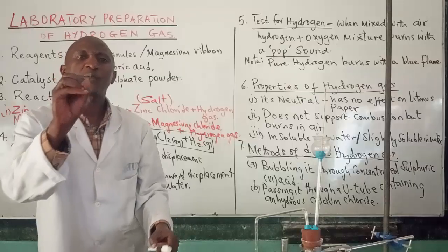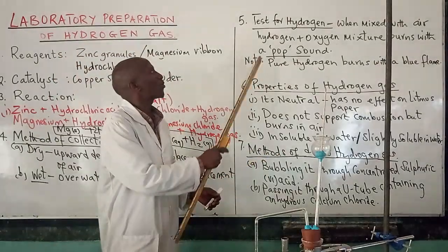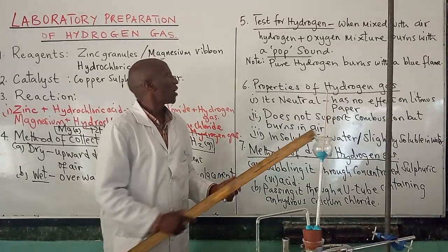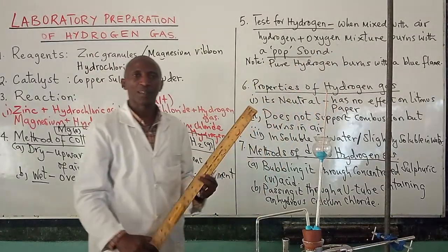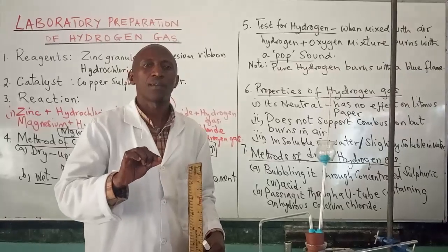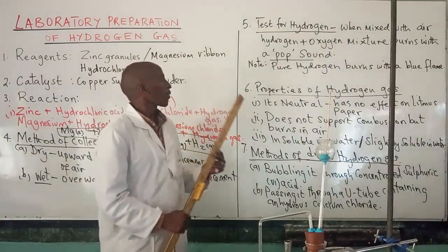Now, let's come to this point here. Why the pop sound? The pop sound is due to the hydrogen having been mixed with oxygen. Otherwise, we say that pure hydrogen burns with a blue flame. It burns quietly, it burns slowly with a blue flame. So that is very, very important.